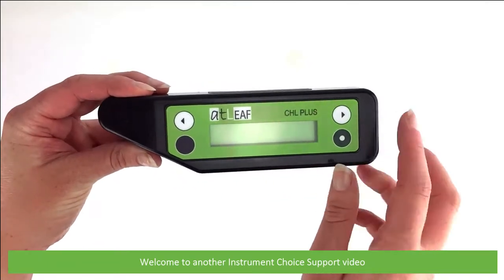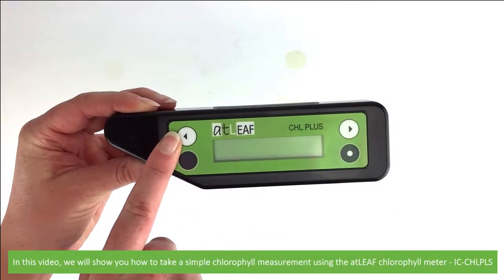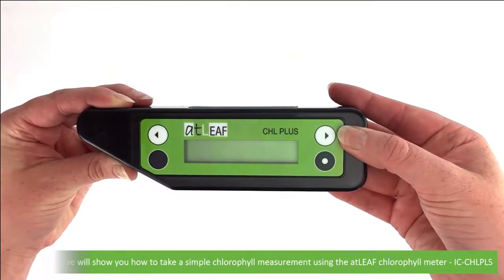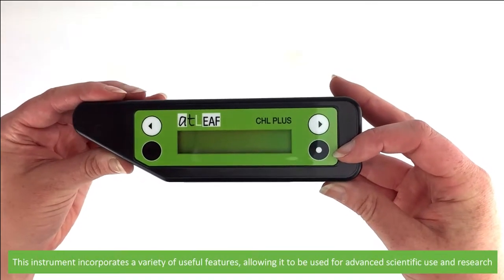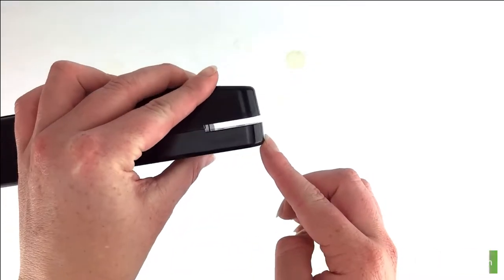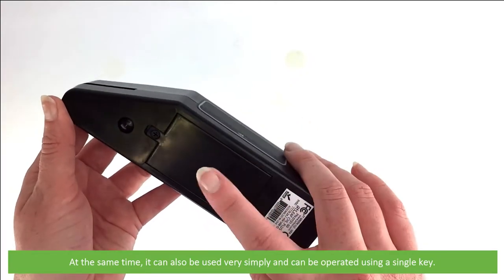Hi and welcome to another Instrument Choice support video. In this video we'll show you how to take a simple chlorophyll measurement using the ATLEAF chlorophyll meter, the IC CHL PLS. This instrument incorporates a variety of useful features allowing it to be used for advanced scientific use and research. At the same time it can also be used very simply and can be operated using a single key.